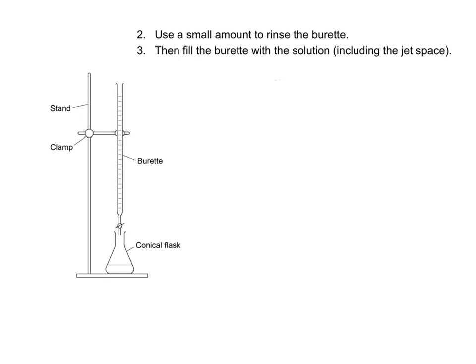Also, don't spend any time trying to get the volume onto zero. As long as it is somewhere on the scale, you're going to measure the difference. So don't waste time trying to zero the burette.